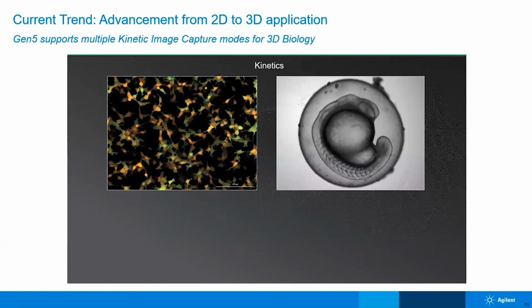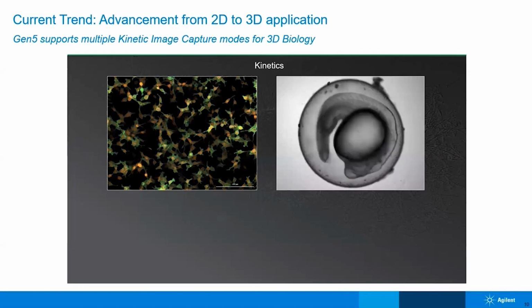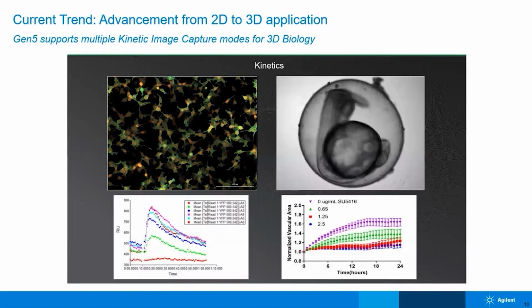On the left, you see an ion channel biology experiment that's happening in seconds. Then on the right is the formation of a zebrafish embryo that is happening in a matter of hours or days. This can be turned into data.